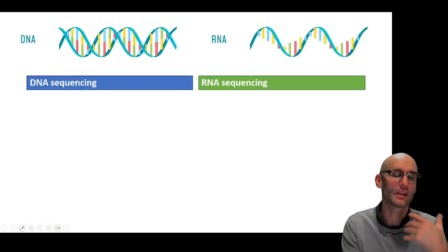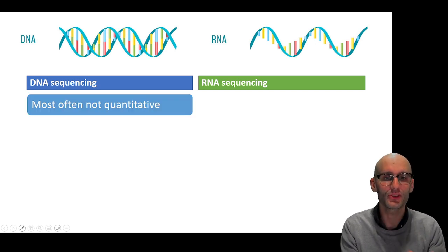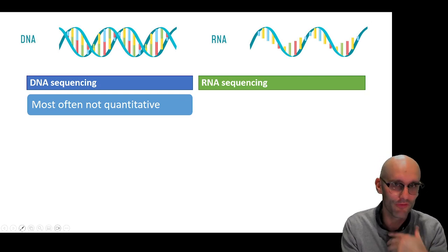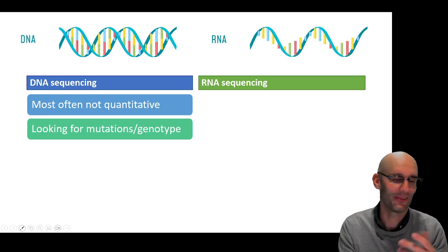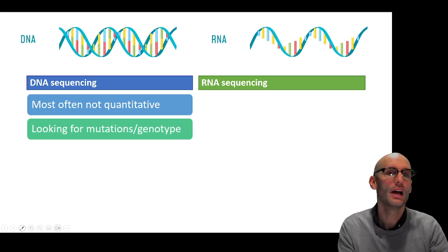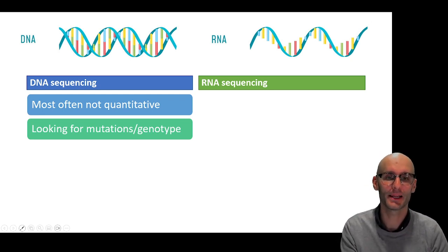And so there are advantages and disadvantages to DNA and RNA sequencing. DNA sequencing is most often not quantitative. Normally we just want to find the mutation or find the person's genome. We're often looking for mutations or genotypes. So do I have the gene for Alzheimer's disease, or there isn't one gene, but there's many. Do I have a risk gene for Alzheimer's disease, or do I have a mutation that causes cancer? That kind of thing can be done with DNA sequencing.